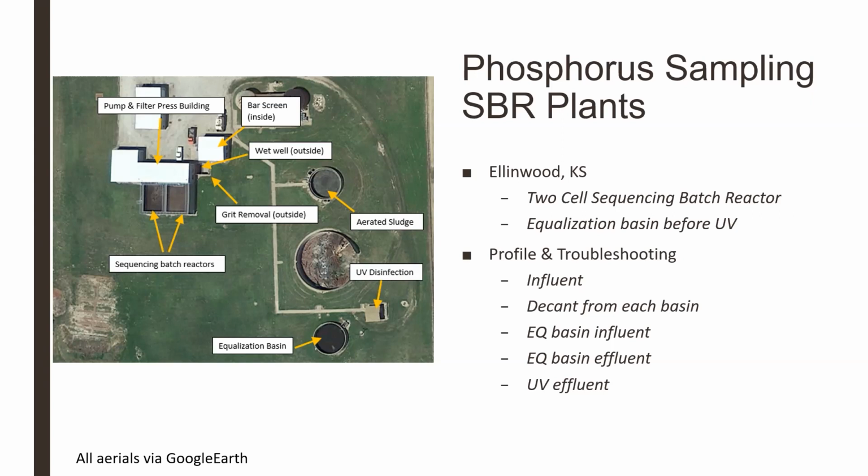And with SBR basin timing, you may want to take it at different times of the day as well, because the influent hitting the basin in the middle of the morning is quite a bit different than the influent hitting the basin at midnight or 3 a.m. So there may be some differences coming off the decant depending on the time of day.